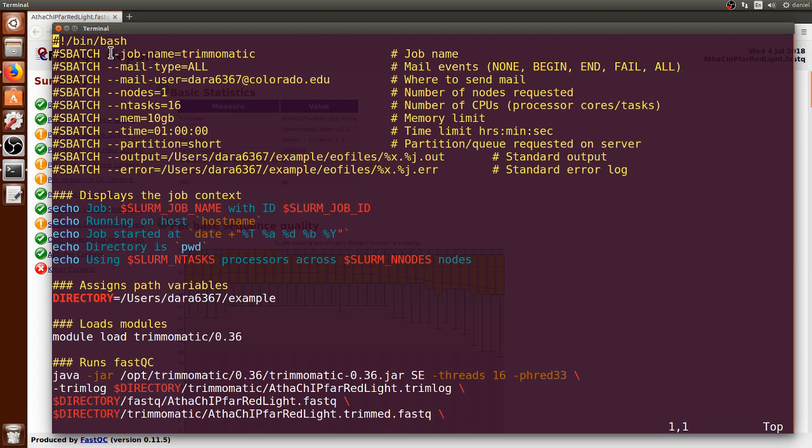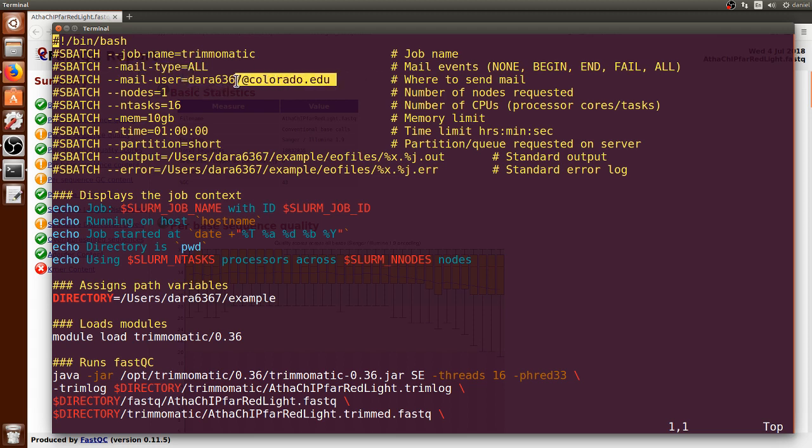In yellow are the specifications that I put on the sbatch file. It's run through the shell. The job name is Trimmomatic, and I want to receive all types of emails in my specific email address, which you will have to change to your own.